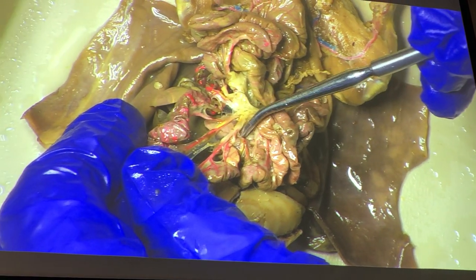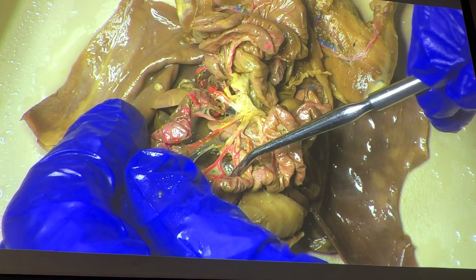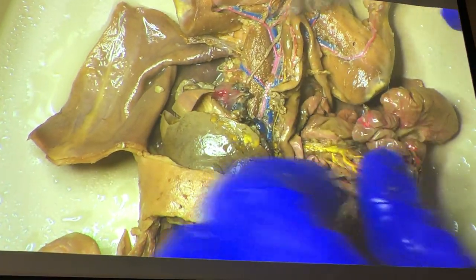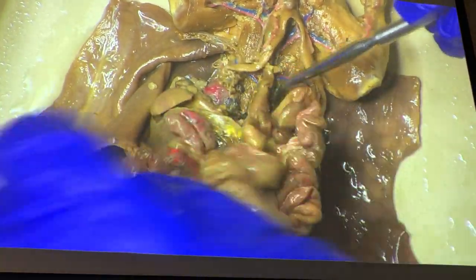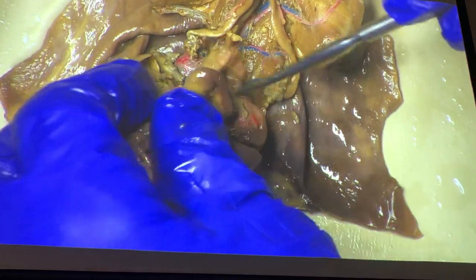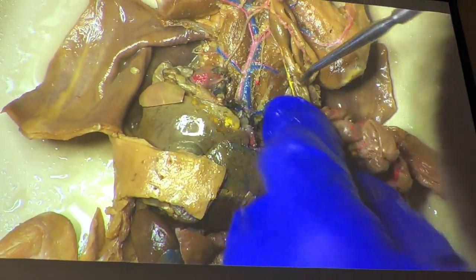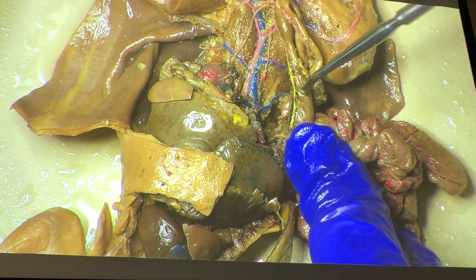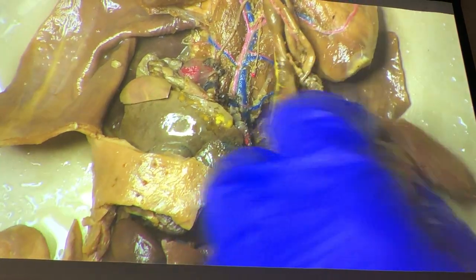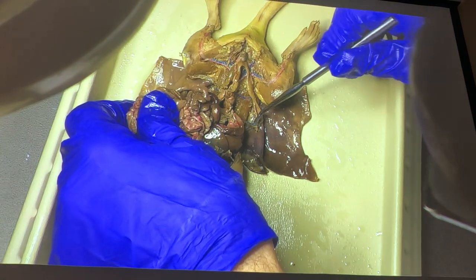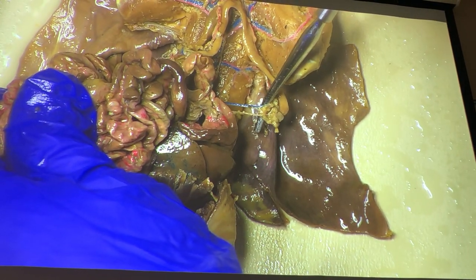Coming up here: mesenteric arteries and veins, with small branches coming off — those are intestinal arteries and veins. I'm not going to ask you about them, but intestinal refers to the small intestine; the large intestine is referred to as colic, so any of these little vessels along here would be colic veins and arteries. We've also got the adrenal lumbar here, and we can see the ovarian artery and vein going to the ovary.